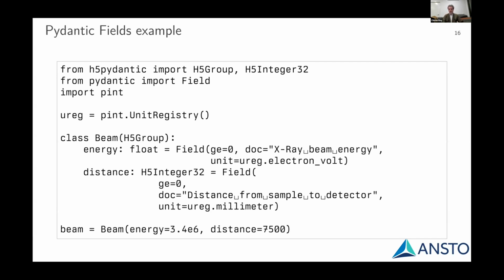So you can sort of see that if you were to start describing your experiments, your beamline, with that level of detail, and obviously more levels of detail, you would get a set of Pydantic models that really, really well explain your beamline setup and your experiment setup. And the hope is that if I've got enough information here describing all of that, then later on I can essentially automatically generate the code required to take all of the outputs from an experiment into the HDF5 file.